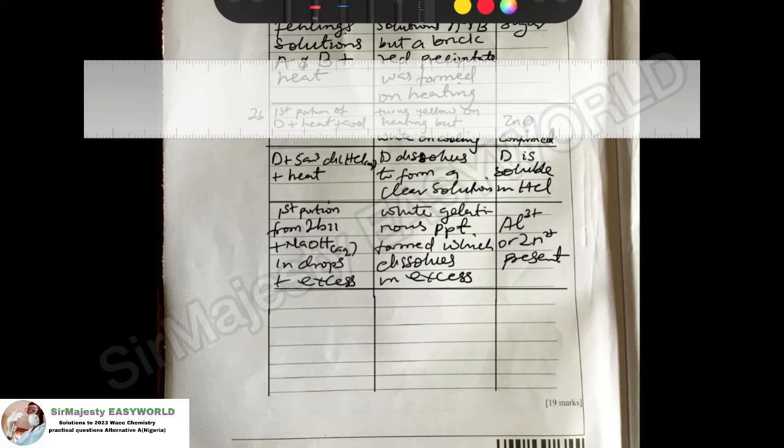Then the next one is the second portion from 2bii plus aqueous ammonia, dilute of course, in drops plus excess. You report the same thing. It's the same observation.